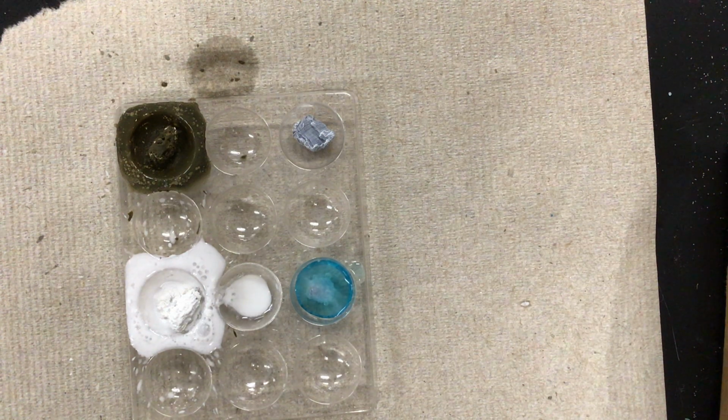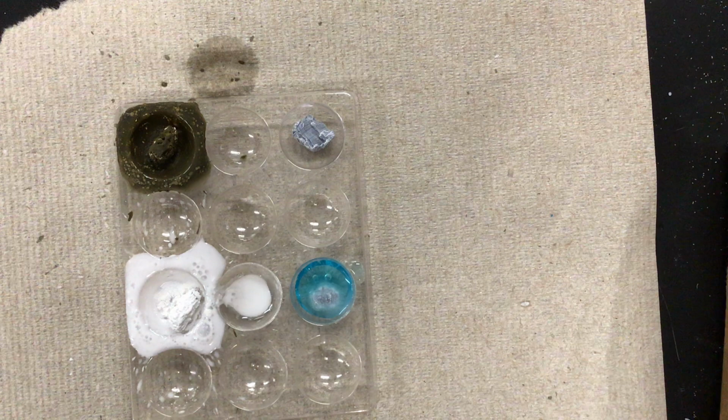So we can see that calcium is definitely the most violent out of the ones that we have seen so far. You can see you have a lot of evidence that calcium is very reactive. And so your job next week is going to be to decide why calcium is the most reactive. So you might want to give that some thought as we watch this reaction take place.